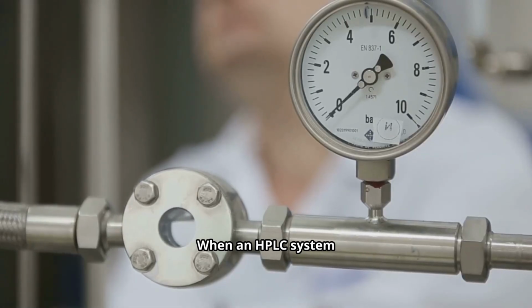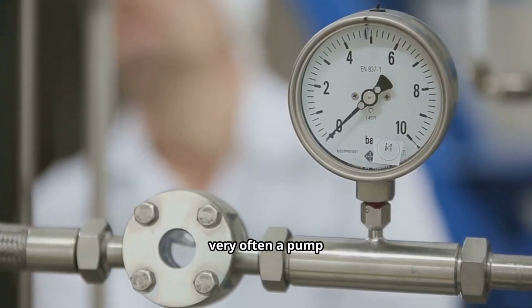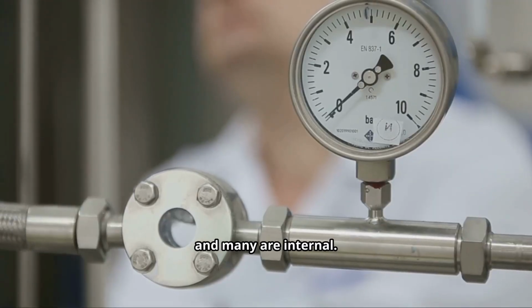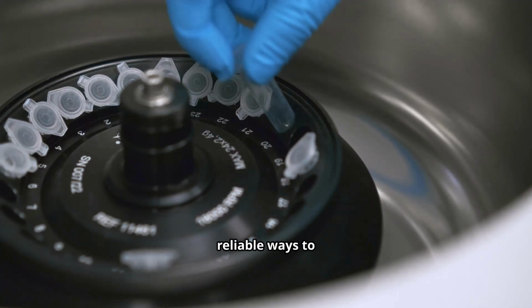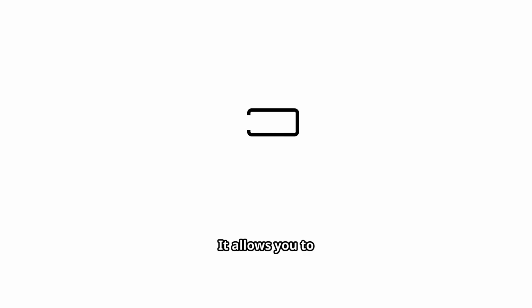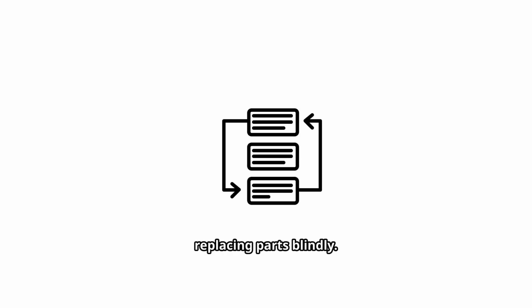When an HPLC system loses pressure or shows unstable flow, the root cause is very often a pump leak. But not all leaks are visible, and many are internal. One of the most reliable ways to diagnose these issues is a technique called pressure isolation. It allows you to pinpoint exactly where pressure is being lost, without replacing parts blindly.